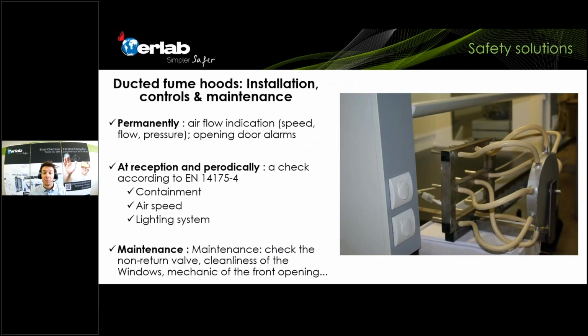So then, of course, maintenance of these safety solutions is also very important. The airflow indication has to be checked. The anemometer inside fume hoods has to be calibrated each time again when you change, for example, a filter. You need to make sure that the maintenance on the safety solutions is well done, and it's not done only during commissioning, but also afterwards, after 1 year, after 2 years. So very periodically, make that a habit.